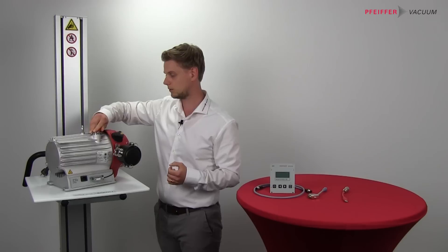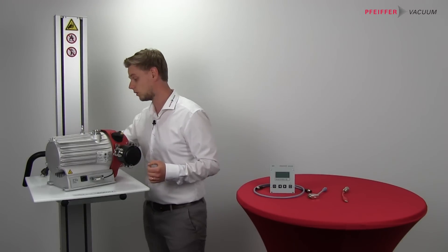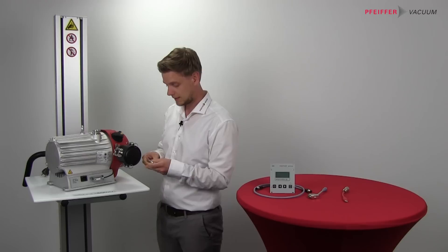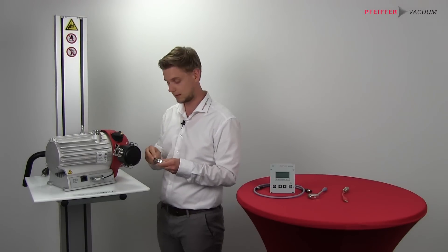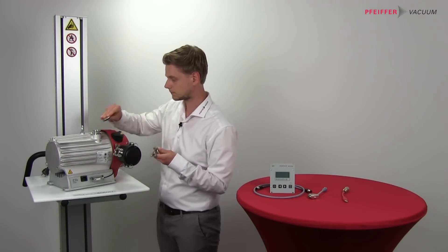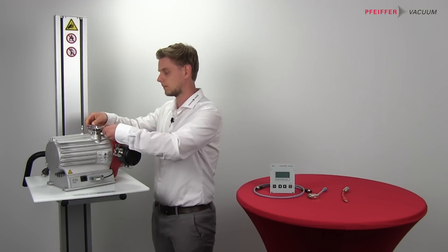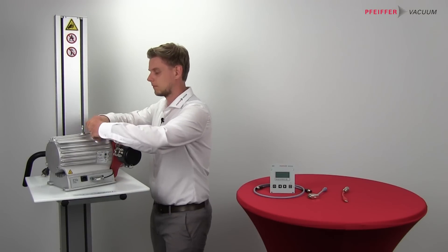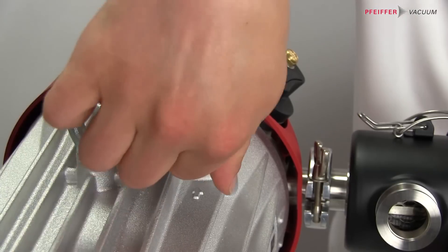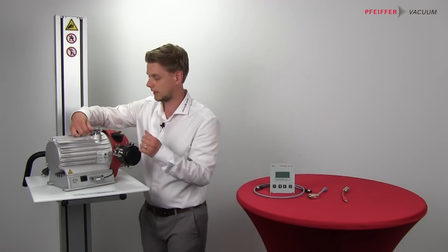Next of all you should install your inlet flange. In this case I will just take a blind flange.